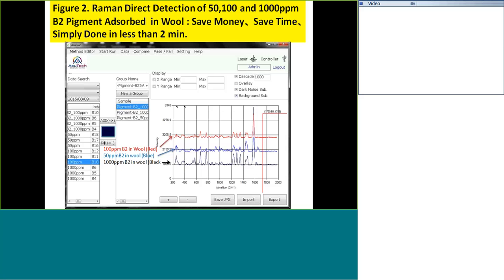If it's two spots, there are two dyes in it. And how do you quantify? You have a hard time quantifying because it's on a piece of paper. So you have to do the transporting from there. Again, you elute it from there with organic solvents, and then you put it into HPLC. And the whole process takes at least 6 hours to get it.